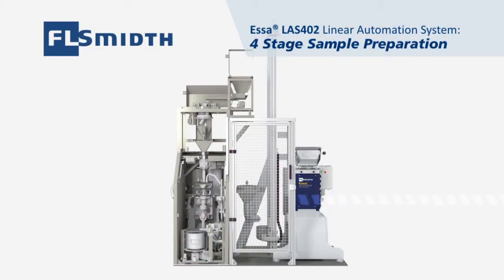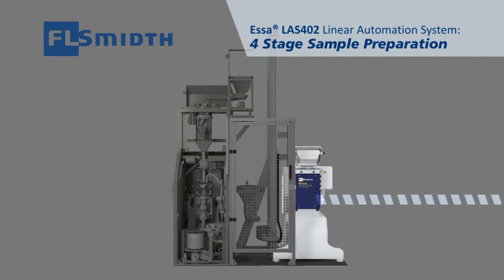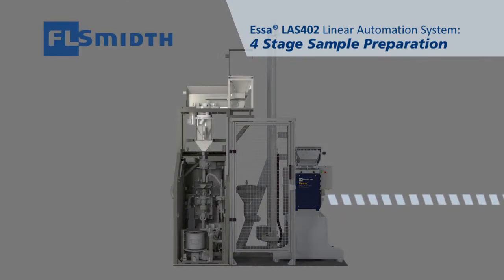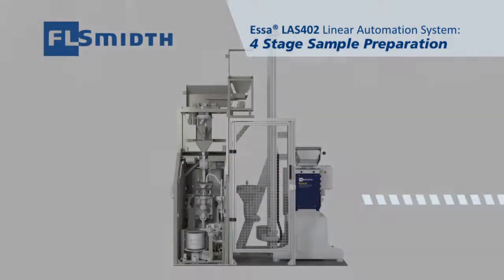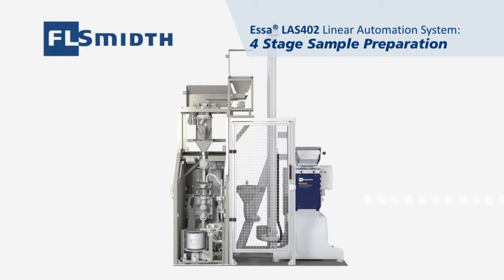The LAS402 linear automation system includes a jaw crusher, variable split rotary tube sampler and a fine autobatch mill with an inbuilt rotary divider. An infeed load cell is also supplied as standard.